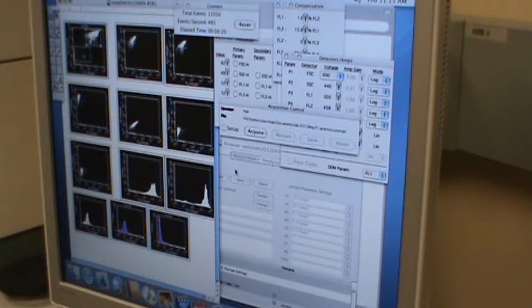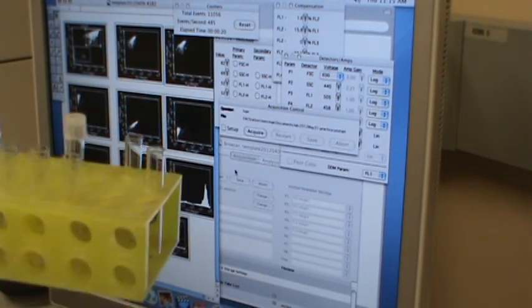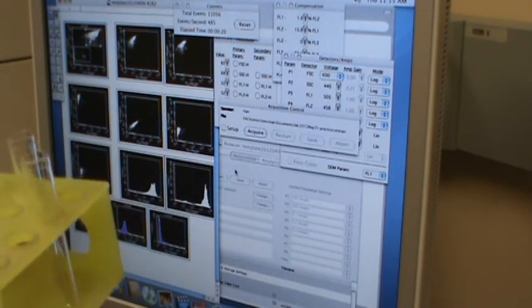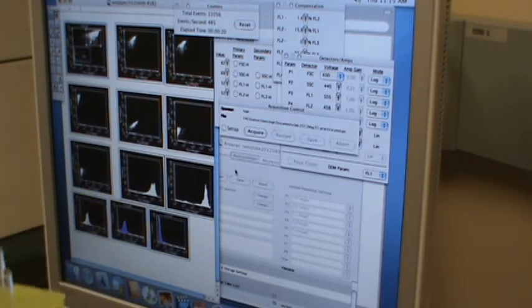So that's done. And then we put this one on standby. Now you need to keep track of which tube you are working on. So this is the tube, and this will be the next sample. You want to take the next sample with this live cell. Yeah, we vortex them so they won't stick together. And then, oops, pull this to there. To keep track of things, we put this on top.